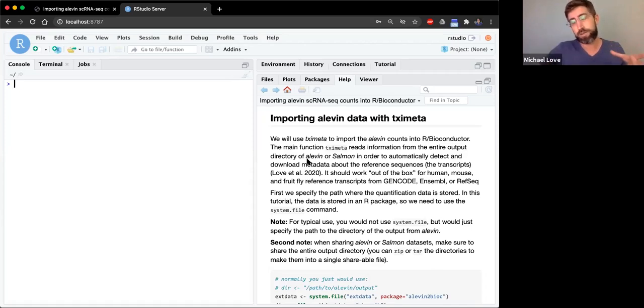You can store the entire cube, so the sparse cube, but we've found, and in this workshop, we only have Alevin outputting the bootstrap mean and the bootstrap variance, and we found that that's sufficient to then make use of the uncertainty in the assignment.